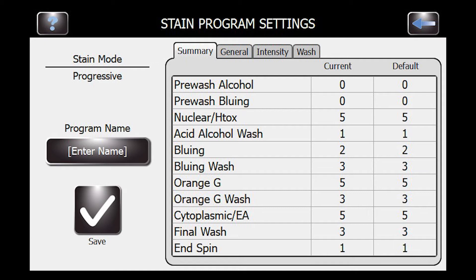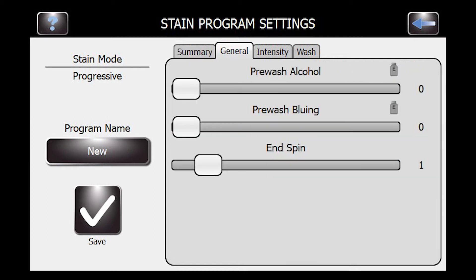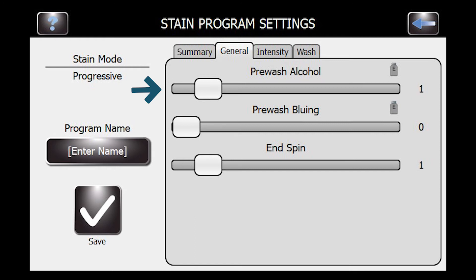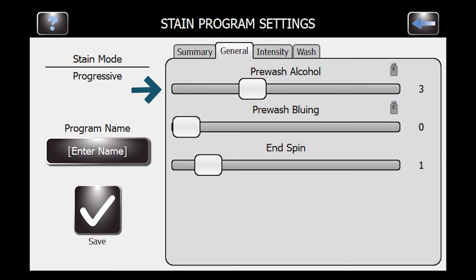Let's go ahead and go to the general tab. The pre-washes are used to wash off carbo wax that the slides have been fixed with. A pre-wash of alcohol of around three will wash off the carbo wax well.